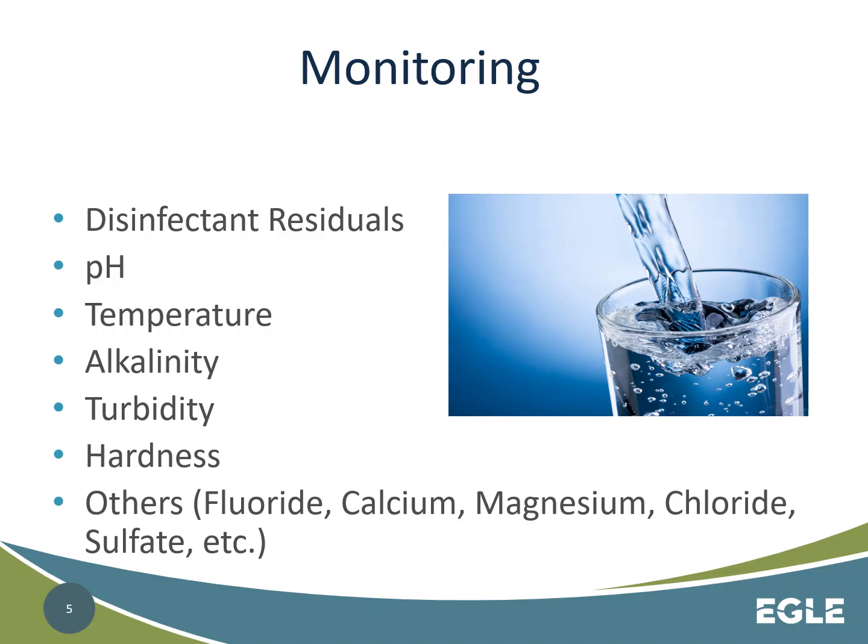The reason that we are required for monitoring too is most of these are done at complete treatment plants, and they are used for compliance, all right? Certain compliance samples can be run on site. Some you have to be a certified laboratory, and there are a number of our water plants that are certified for running bacteria samples, and that requires going through the lab certification with our lab certifiers here at the state. And what they do is they make sure that anything you are going to be certified to run and do, that you're following the standard methods procedures that are approved by the EPA, and they come out of the standard methods books.